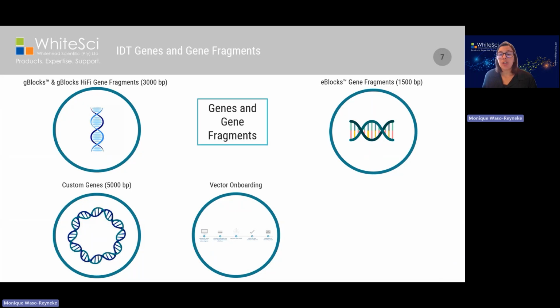The tool will then ask you a variety of questions. You will name your vector, you will give us the sequence information, you will tell us whether this vector can be cloned into E. coli, whether it has selection markers, and then you also tell the tool where in that vector your insert needs to go. So you will give it some gene sequences before and after the cloning site, and you will upload the gene or the vector backbone.